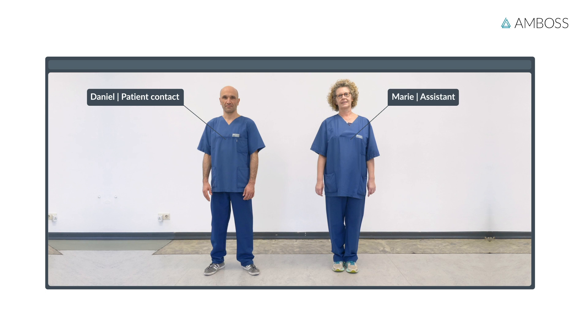Daniel will engage in patient contact, so he will need to put on personal protective equipment. Marie will assist him. Eventually, you should be able to put on protective clothing without assistance.